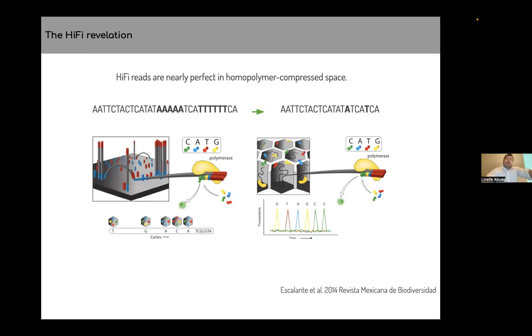The way PacBio describes it is, let's not even consider the homopolymers. Because PacBio, like every other sequencer that has this non-stop sequencing, will have this problem for homopolymers because the signal sensitivity will be compressed. So you don't know after 6 A's in a row if you have 7 or 10.